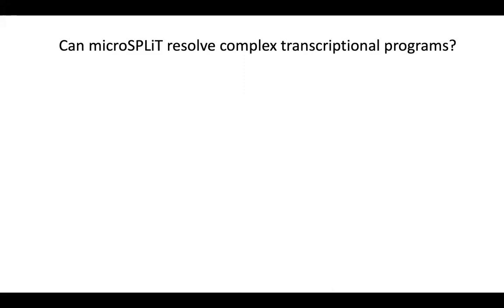So, question. You say you have something like 200 to 300 transcripts per cell. So how many genes do you have in the E. coli genome that are actually getting transcribed? We don't know how many transcripts are truly there, or what the actual truth is. But if you look at bulk sequencing, how many transcripts are getting expressed?